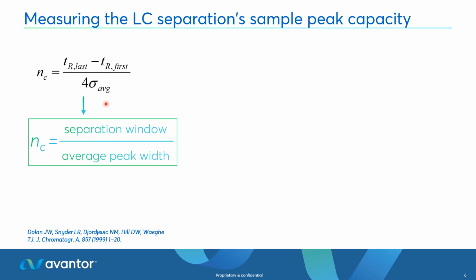And here I'd like to show the equation in a bit more detail with the maths and the chromatogram that we see. This was taken from a paper by Snyder and Dolan, very famous and highly respected scientists in our community. I also want to point out that a scientist from MacMod was included in this publication. So let's go back to the equation.